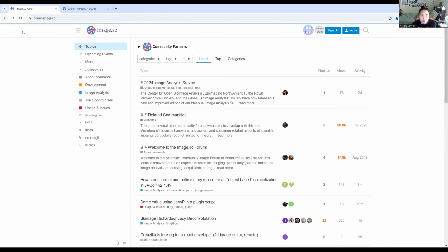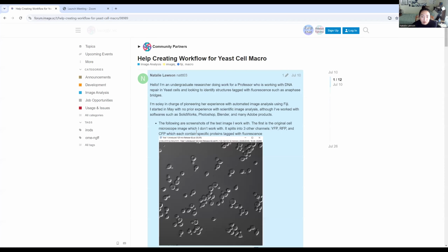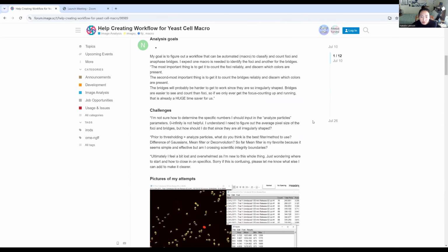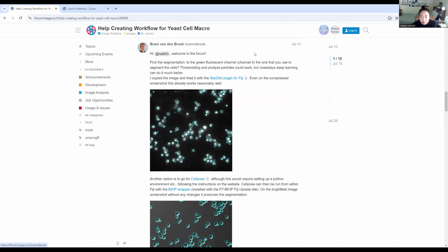And I think you should read through my posts, so I linked them here. In July, this was my first post. And then Bram van den Broek responded to me. We had a good thread, and essentially we learned that Stardist and Cellpose are the two plugins that you should really explore for this project.